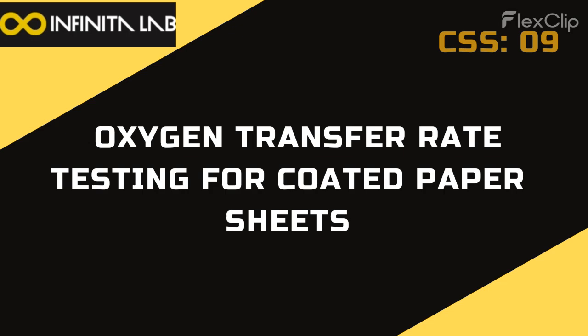And I think they had to follow a specific standard too, right? Wasn't it something like ASTM D3985? Yeah, you got it. ASTM D3985, that's the one. And these standardized tests, they're like the rule book for tons of industries. They make sure everybody's measuring things the same way, so you can compare apples to apples. And it's super important when you're talking about things like food packaging, because even a teeny tiny difference in oxygen transfer rate can mean fresh strawberries versus a container of mold. Nobody wants that. No, definitely not.